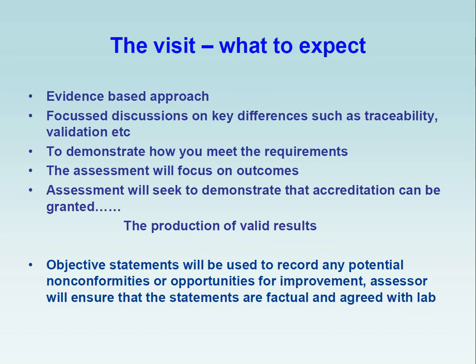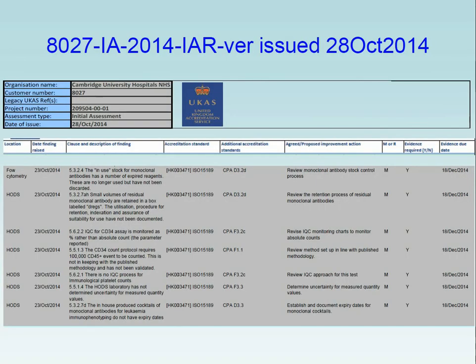So we had our visit on the 23rd of October, and this was issued on the 28th, and this is a summary of the non-compliances that we received within the flow lab. And I'm just going to go through each one of these non-compliances and how we addressed or how we tried to address them as an example of how we did it.